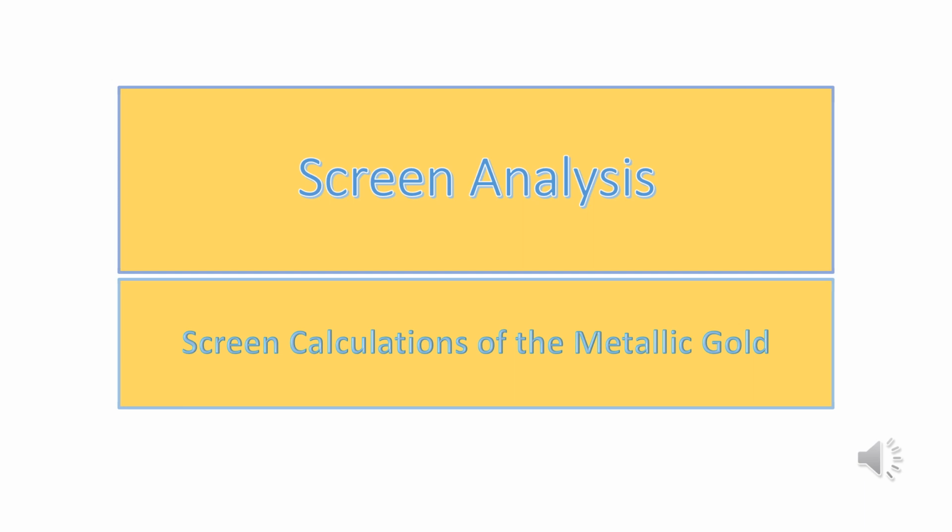On the last presentation I did, we talked about the assay ton system, what it was, and the calculations behind it. I get a lot of requests and questions regarding analyses out in the field, and these usually come from the small placer miners or the small hard rock operations. In this presentation, I'd like to answer some of those questions. So what I'm going to look at is screen analysis.